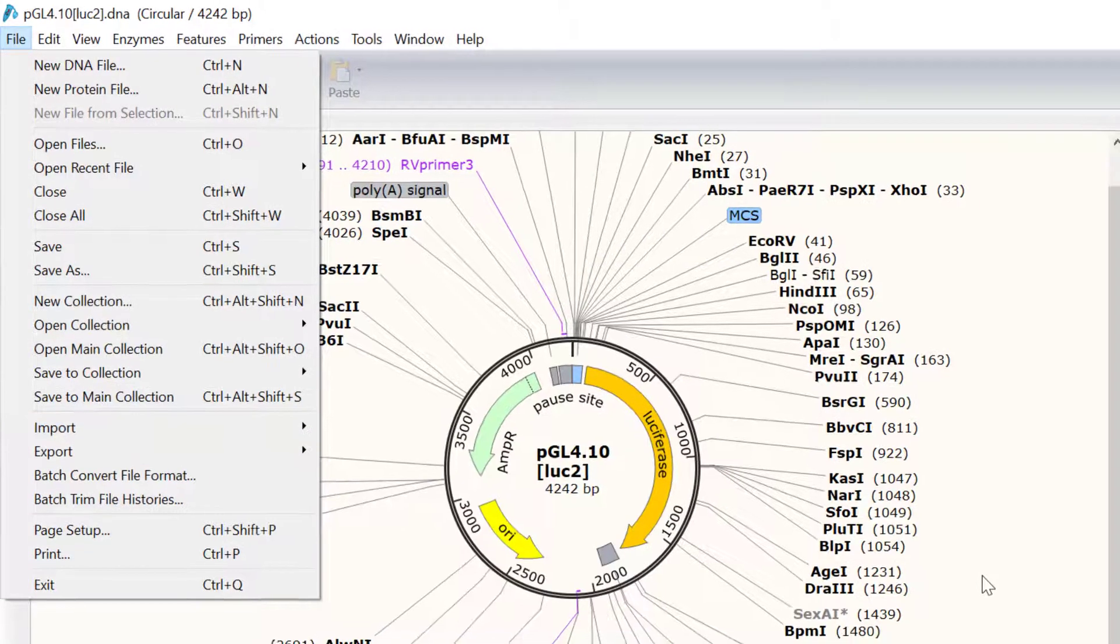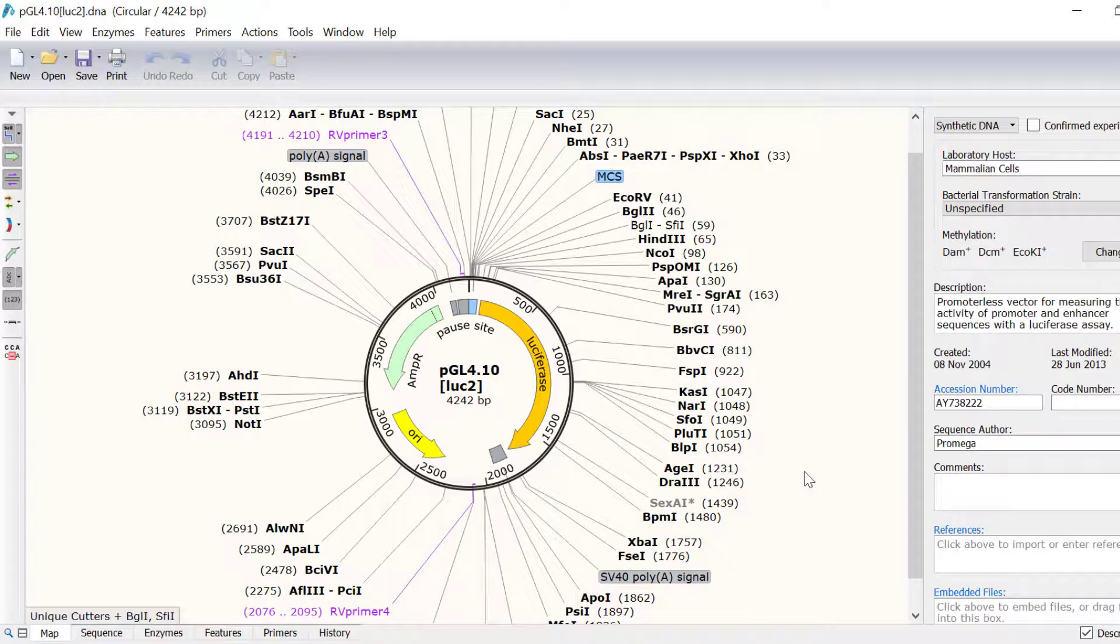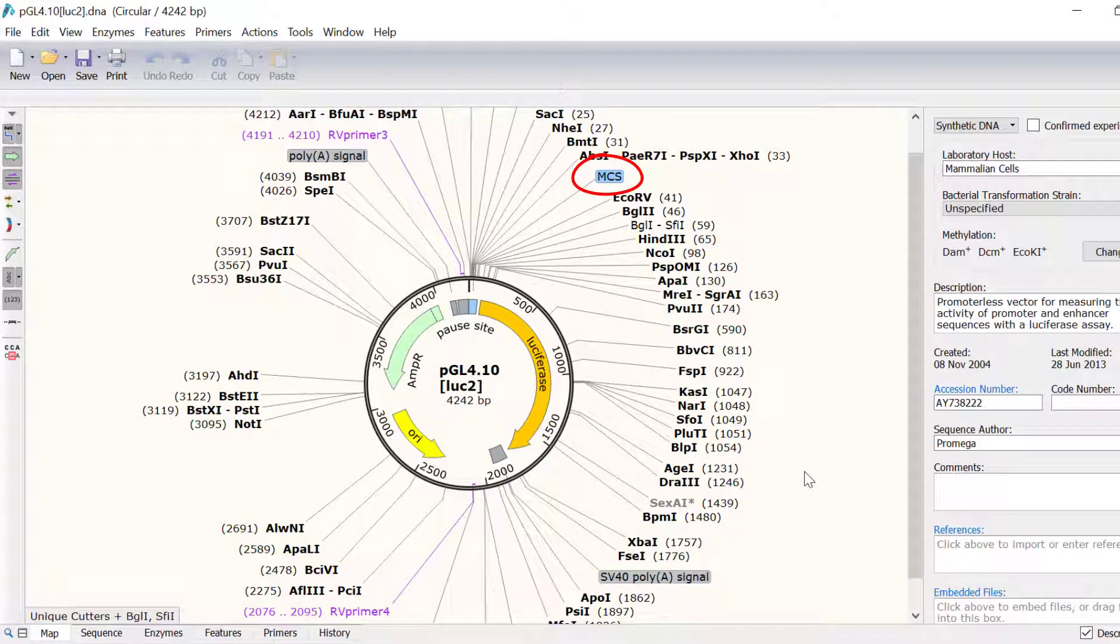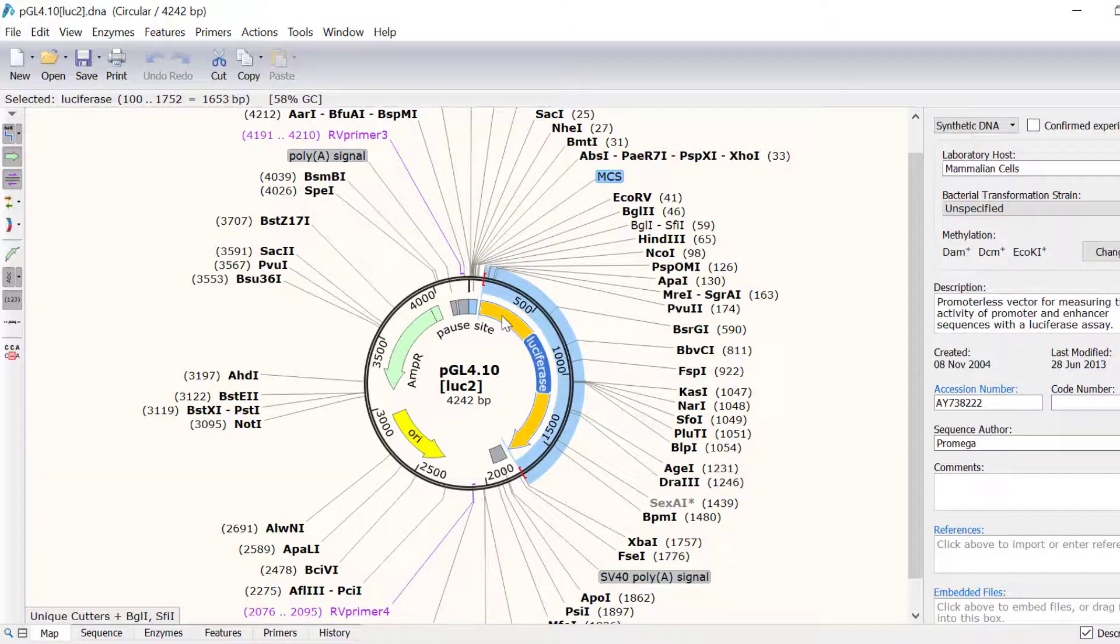Let's now take a look at the plasmid. The PGL4 plasmid contains a multiple cloning site, or MCS, as indicated by this feature in blue. Adjacent to the MCS is a luciferase reporter, indicated by the orange arrow.